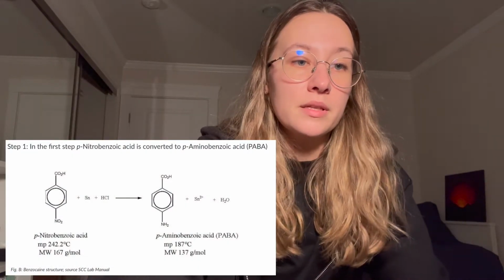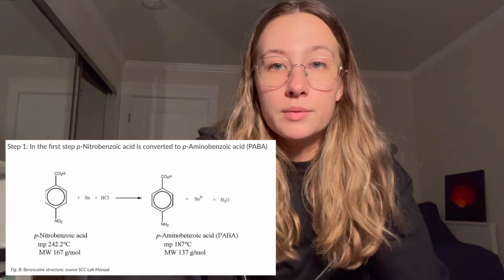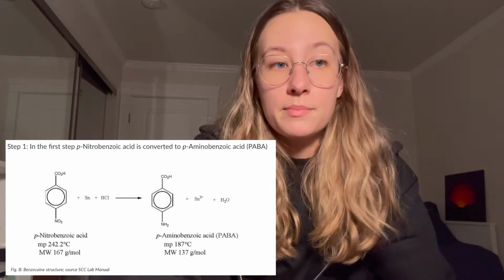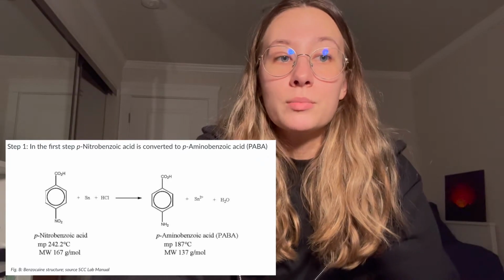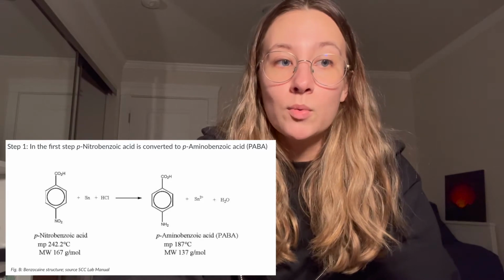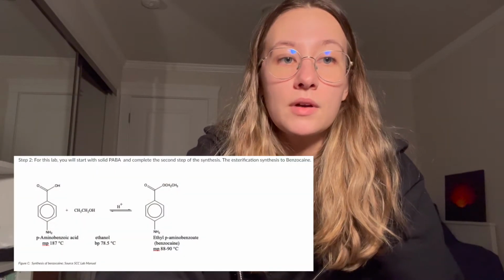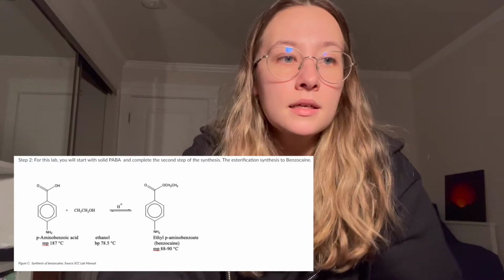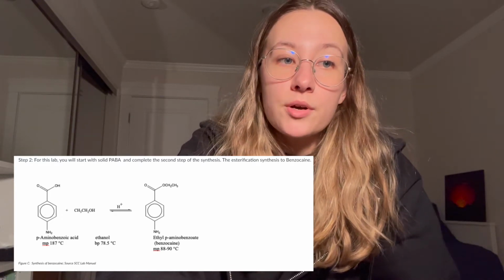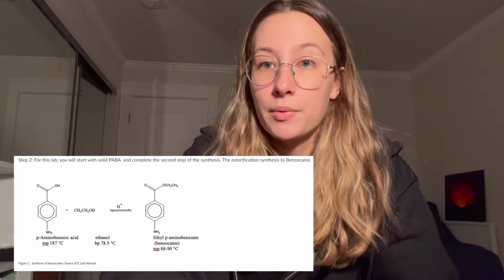Generally, the synthesis of benzocaine is a two-step process, but for the purposes of the experiment performed, the first step of p-nitrobenzoic acid being converted into p-aminobenzoic acid, or PABA, was skipped, and the procedure started with solid PABA rather than p-nitrobenzoic acid.